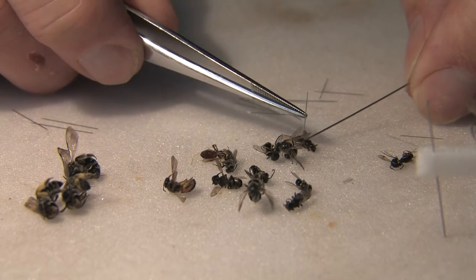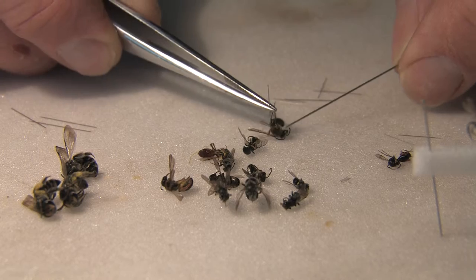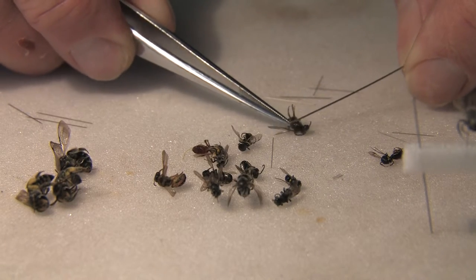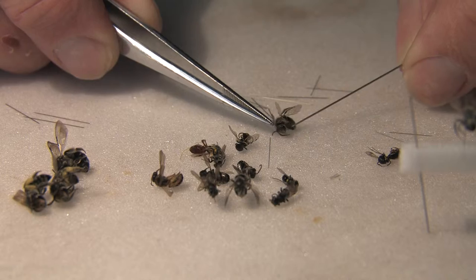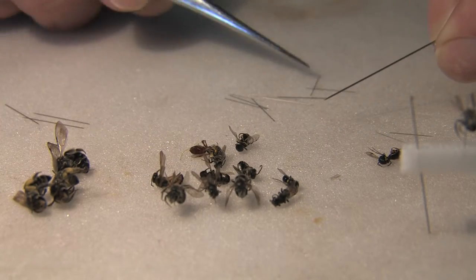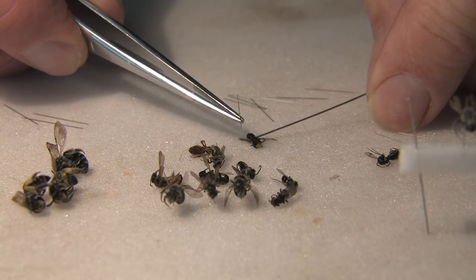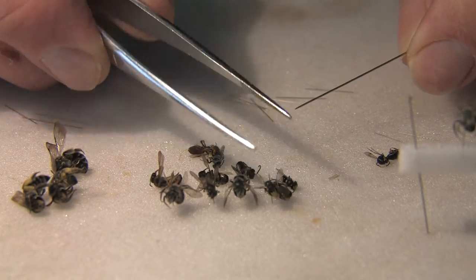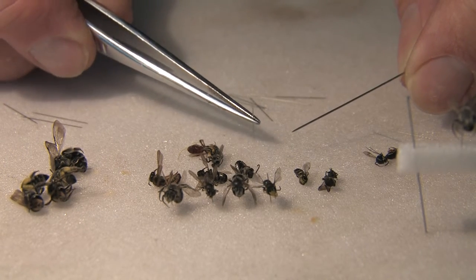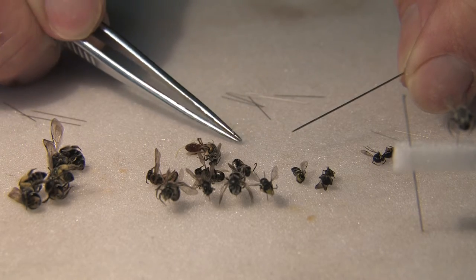Just check to make sure which is the pointy end before pinning through the mesoscutum or metanotum. Remember that the mesoscutum often has a lot of very useful punctation characters, so it's best not to make too much of a mess of it. If you want, you can do this under a magnifying lamp. One way to test pin orientation: if you stick the minuten into the pith blunt-end first it's difficult, but if you flip it over it goes in very easily.